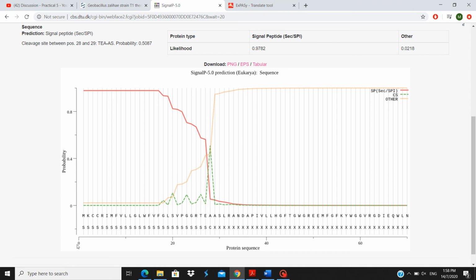And here is the protein sequence that we took from ExPASy and translated, and put in SignalP. This protein sequence contains the signal peptide that we need to remove and the sequence of the protein that we need to make a multiple sequence alignment for. So how can we know where this starts and ends? We use these three scores.